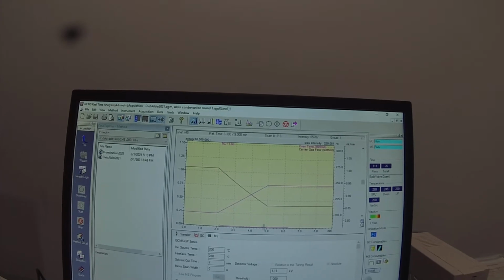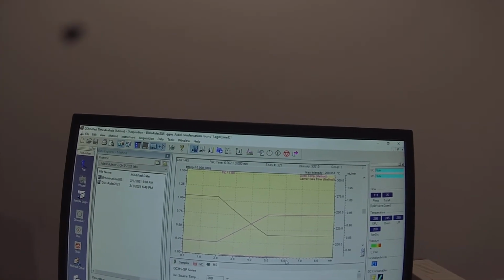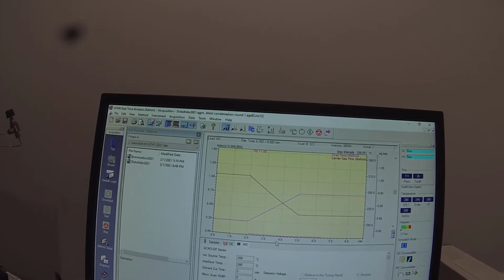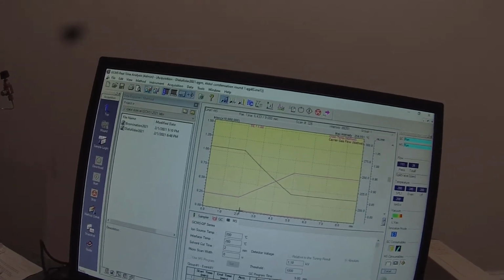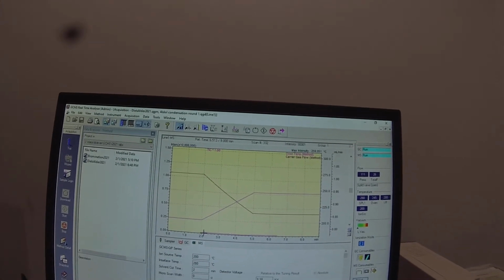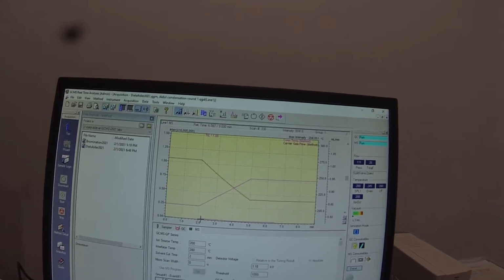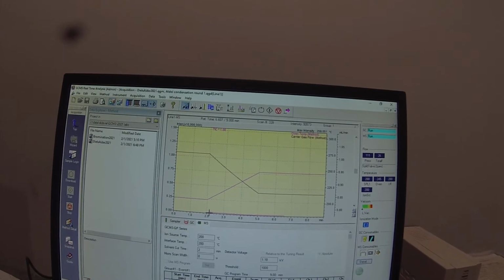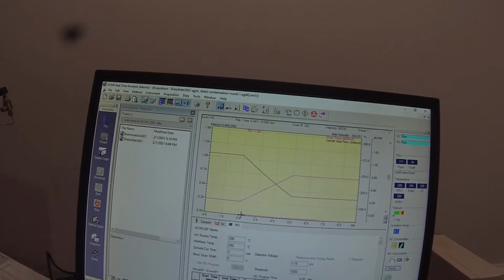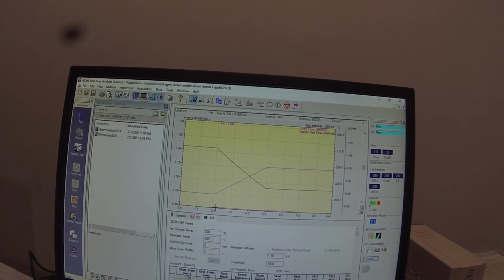So there's nothing between 2 and 6 minutes. It's possible that it came off too quickly. I think that's relatively unlikely. It's also possible that at these high temperatures we get some reverse aldol, but in the absence of water, we really shouldn't be able to reverse that aldol condensation.